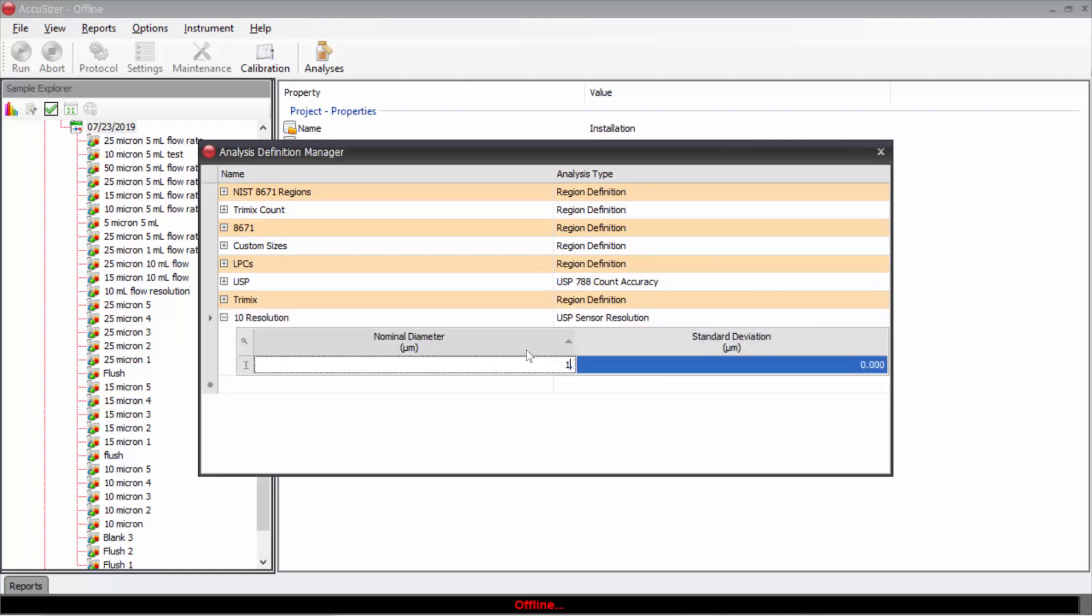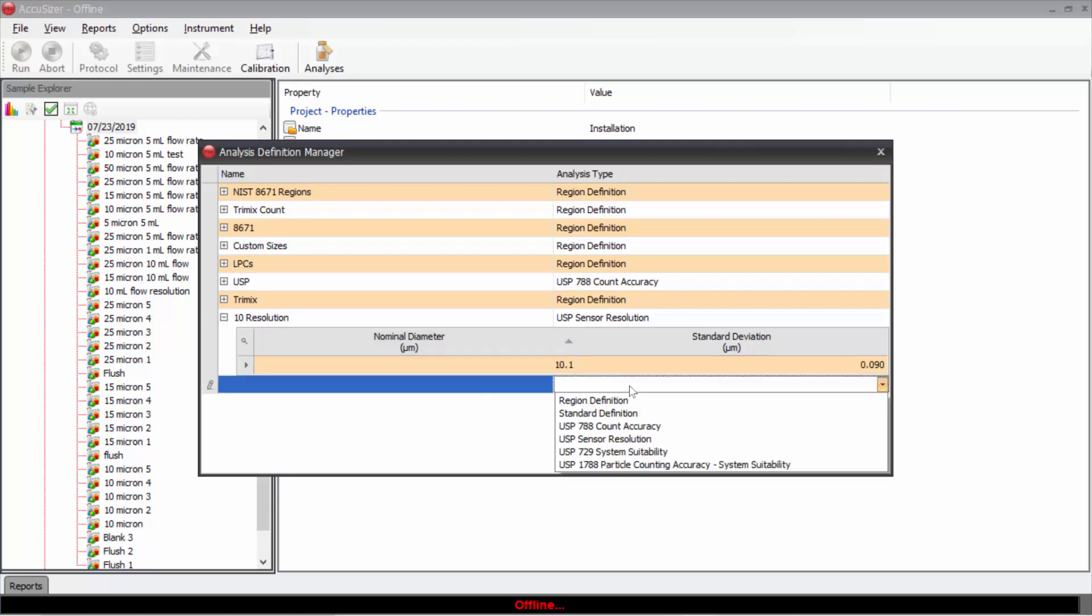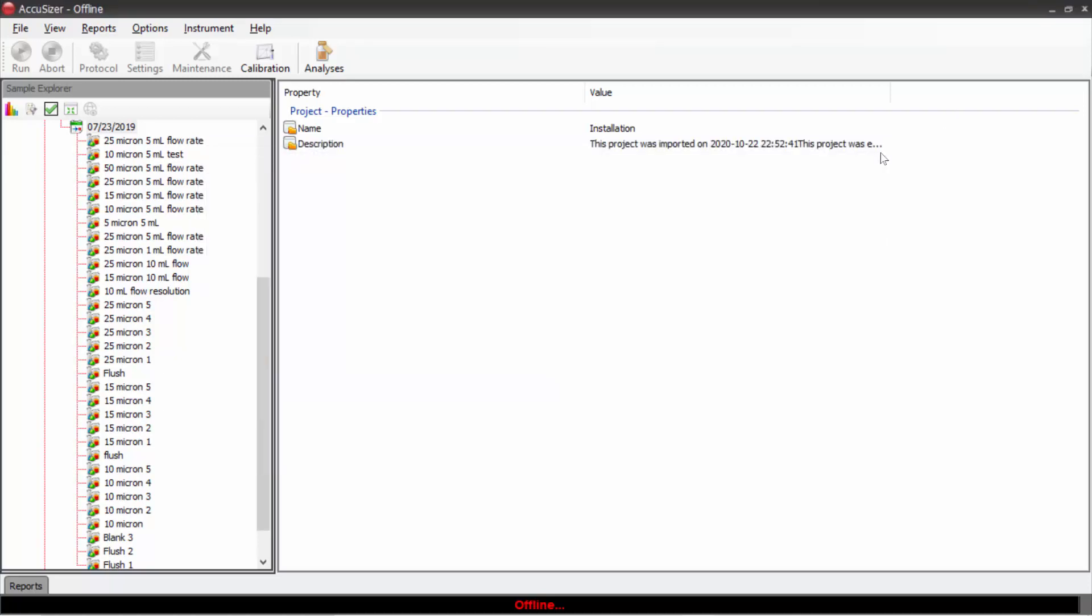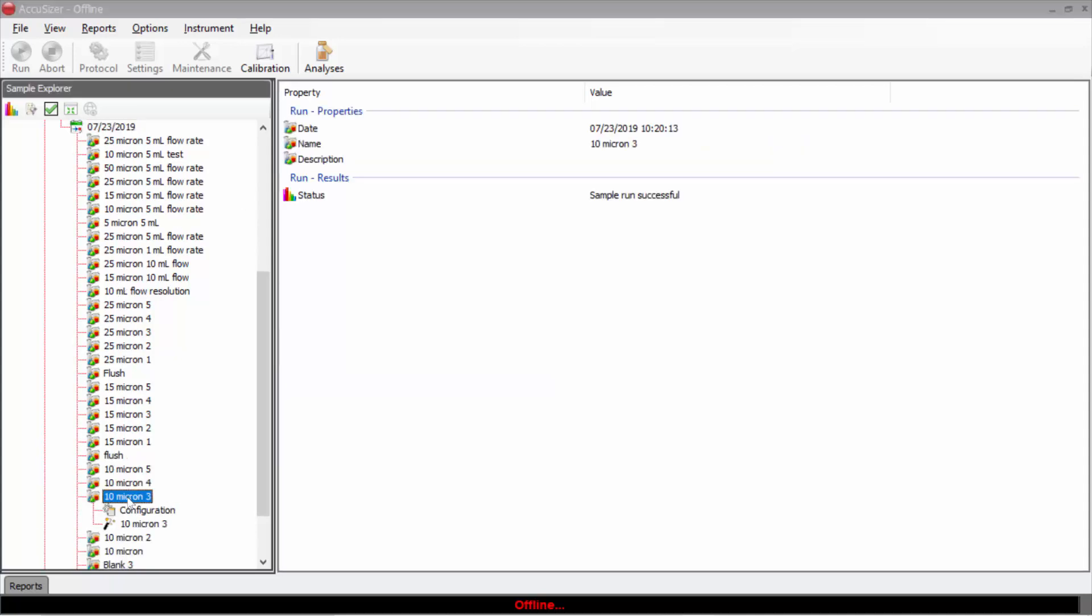Let's say that it was actually 10.1 was the diameter for the standard and what if the standard deviation was 0.09. I now have entered that information. And what I can do is take a 10 micron result.